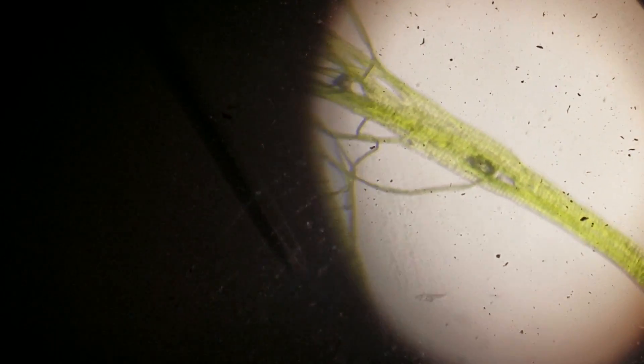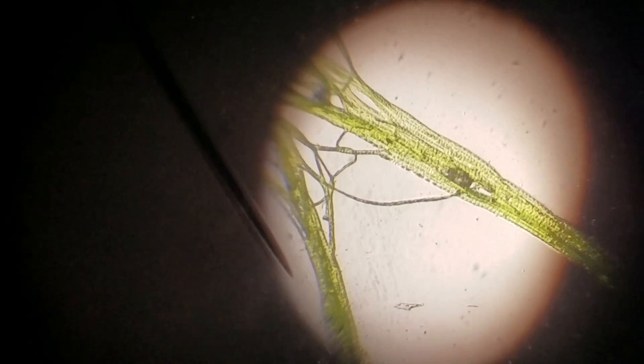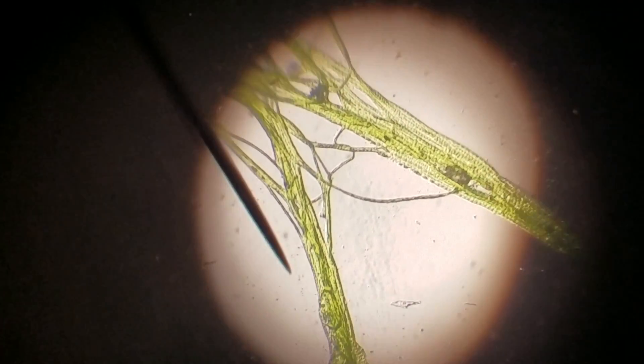You can make out the fact that there are actual cells. See on the bottom line there? Looks like a dotted line — those are cells. Those are individual cells of cyanobacteria.